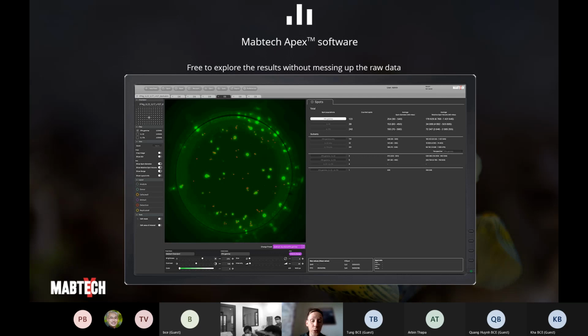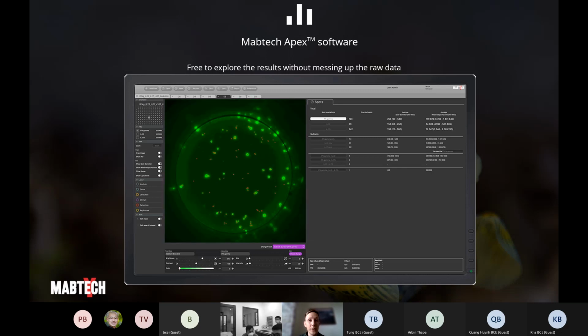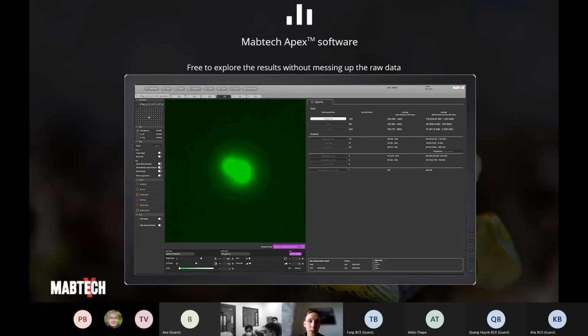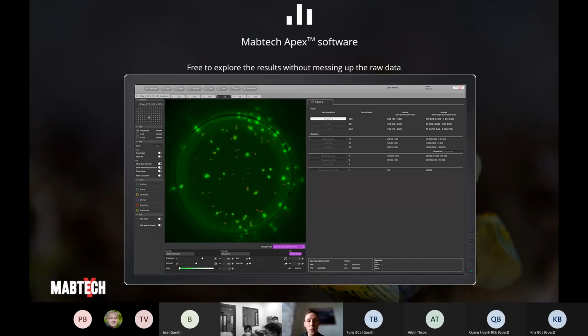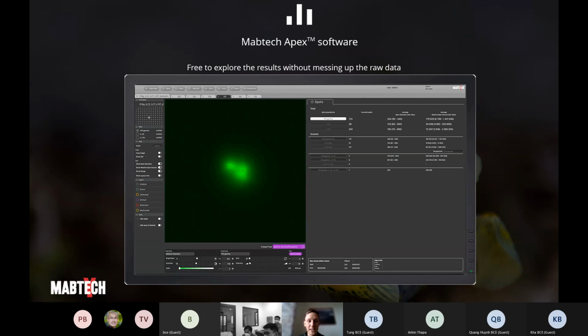You will notice when you start to work with the equipment and the software after the training on Monday that it's very user-friendly. Many of our customers that have run competitive equipment before are very used to quite comprehensive and time-consuming calibration processes. It's not intuitive in that kind of systems how you should work with the programs and so on. So what we have done here is to basically revolutionize the way of working in a software with this type of analysis.